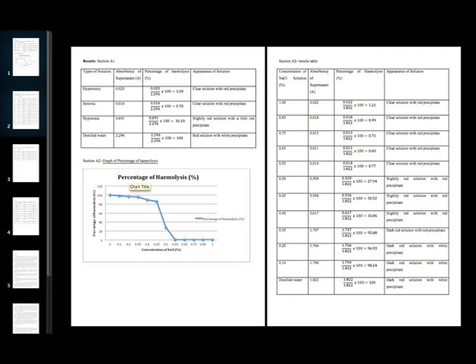After centrifuging, hemoglobin escapes through the pores on the plasma membrane. That is why the supernatant is red, resulting in a high value of absorbance. A white precipitate can be seen at the bottom, indicating the complete loss of hemoglobin by the red blood cells.